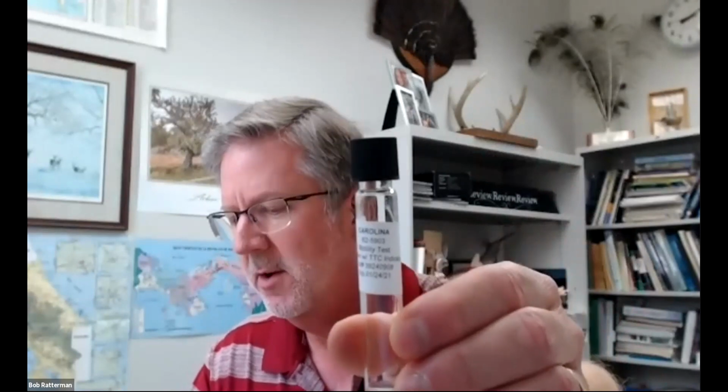The second material that we used for exercise 17 was another motility medium that we buy. Deb does not make this. It's called motility test media. I don't know if you can quite read that, but I'll just read it for you. It says motility test medium with TTC indicator. Now, TTC is referred to as triphenyl tetrazolium chloride, and there's a little blurb here that Deb put on the table where these tubes were being placed, and this will be back there for you to reference if you ever need to look at this again.